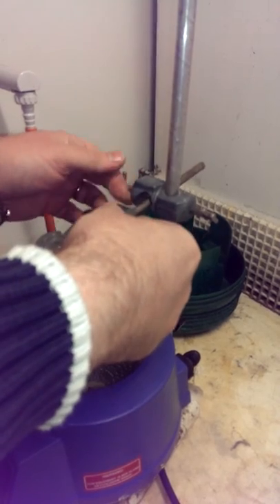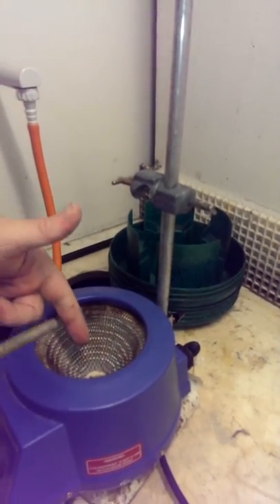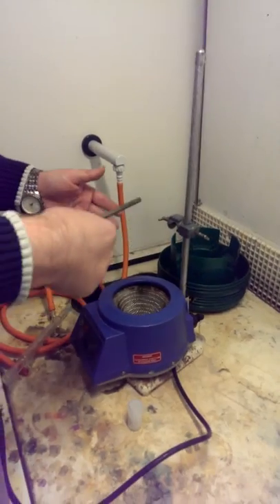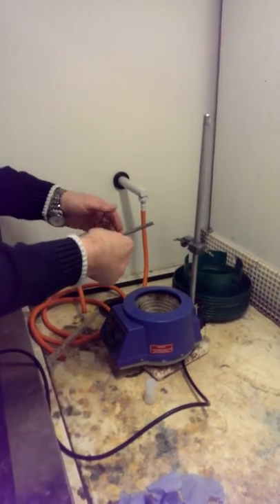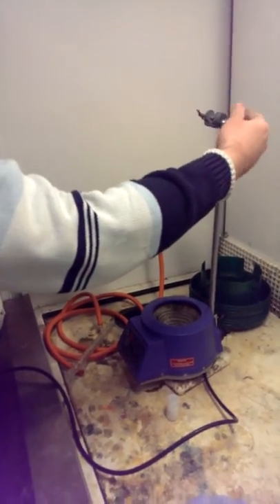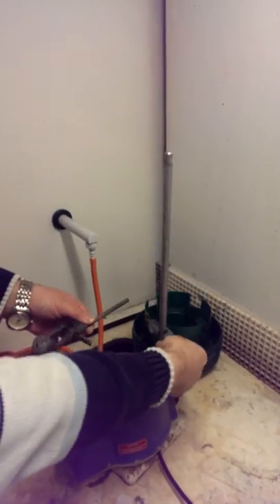Where you clamp in the other way with a boss, you actually then have to push down in towards the source of the heat. Imagine this possibly being on fire, which it won't be, but you obviously don't want to put your hand into something burning to start with. So again, my advice for boss and clamp is to be in this kind of setup.